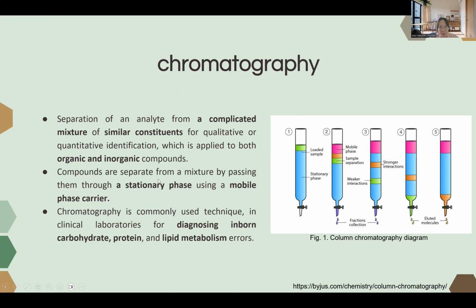Compounds are separated from a mixture by passing them through a stationary phase using a mobile phase carrier. Chromatography is a commonly used technique in clinical laboratories for diagnosing inborn errors of carbohydrate, protein, and lipid metabolism.